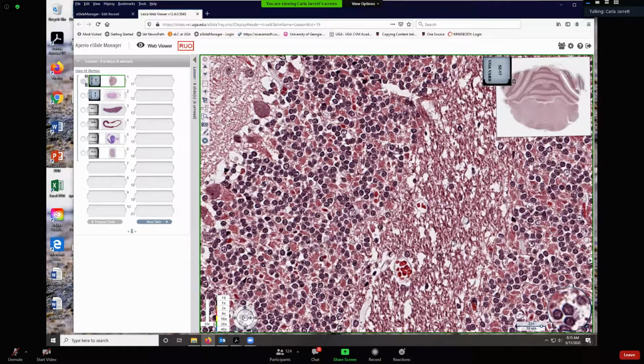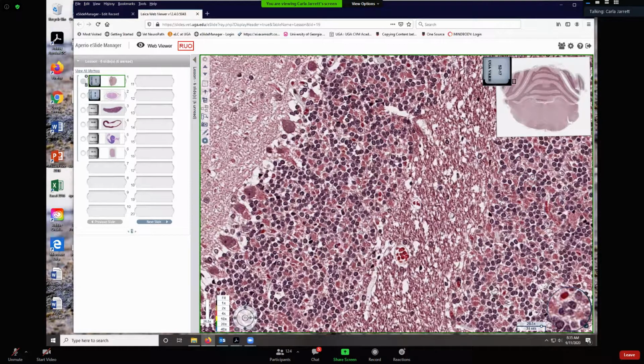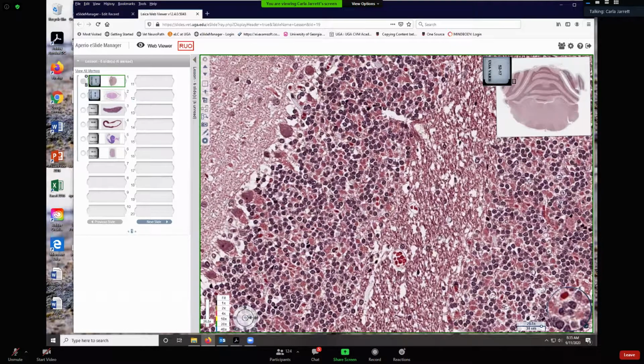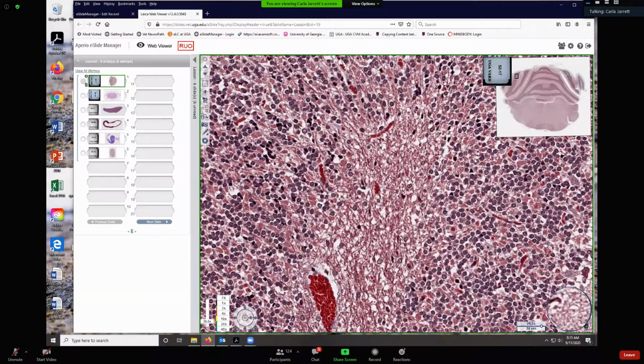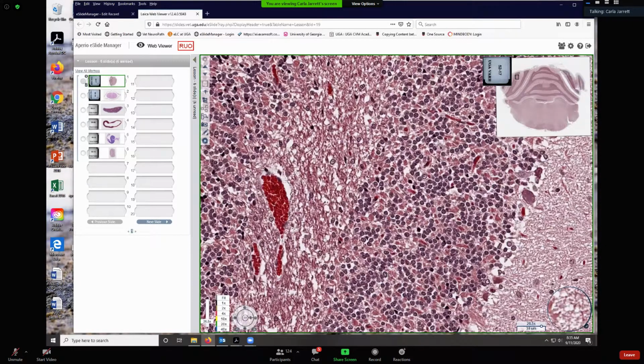Well, they're not. They're granule cells. These are specialized neurons, little excitatory neurons. Interestingly, the most excited or hot rod neurons tend to be small neurons. The big ones tend to be kind of lazy. So these are granule cells and piriform cells. Okay, granule cell layer, and just like all the other layers, here it is, coming up, bending at the apex of that folium and coming back down.